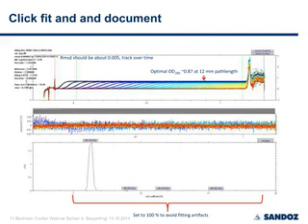Therefore, I set a range where the protein is located, here in this case from 5 to 19S to 100%, and calculate the peaks respectively. So I click on the boxes and report the percentage species of, and calculate percent of total protein.